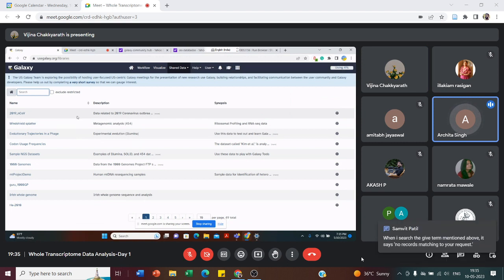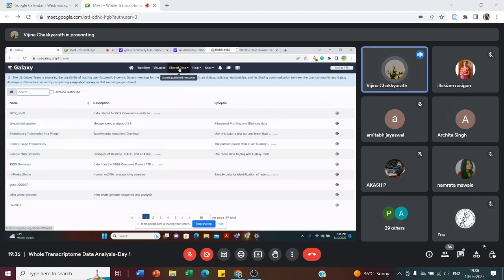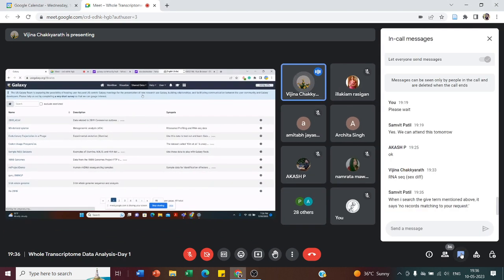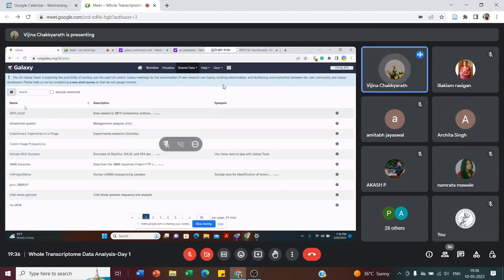Ma'am, can you again tell us from where I will get the data? I'm not able to get it. One minute. Okay, you just go to shared data, then data libraries. Then you can type here tutorials.